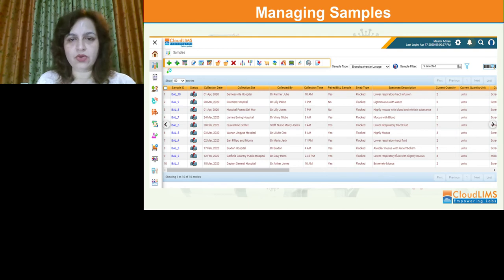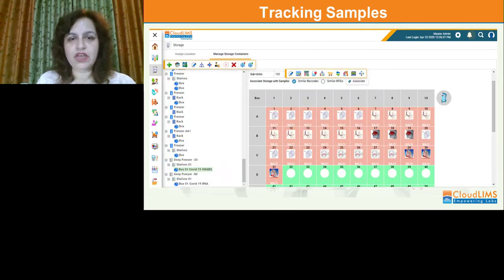Sample tracking also can prove to be a challenge if a LIMS is not available. After a sample is received, it may be lost if the storage location of the received sample is not maintained. A LIMS provides a virtual storage setup and enables visualization of the sample location. So at any given time, if the sample is not being processed, the lab personnel know exactly where it is stored and therefore from where it can be retrieved.